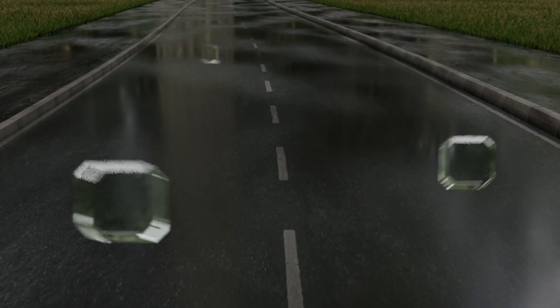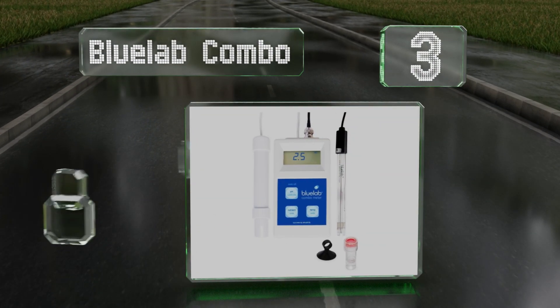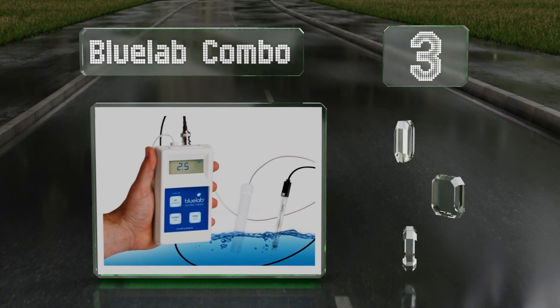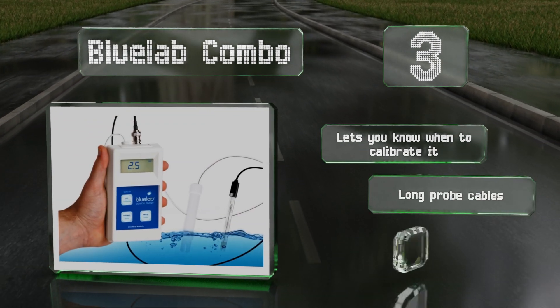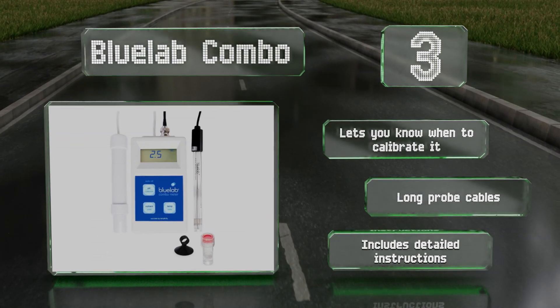Nearing the top of our list at number three, the Blue Lab Combo may be overkill for home use, but it's invaluable in commercial settings. It has a replaceable dual-junction probe and measures every important water variable for plant growth and seed germination. An auto-off feature ensures you don't waste the batteries, it lets you know when to calibrate it, and includes long probe cables and detailed instructions.